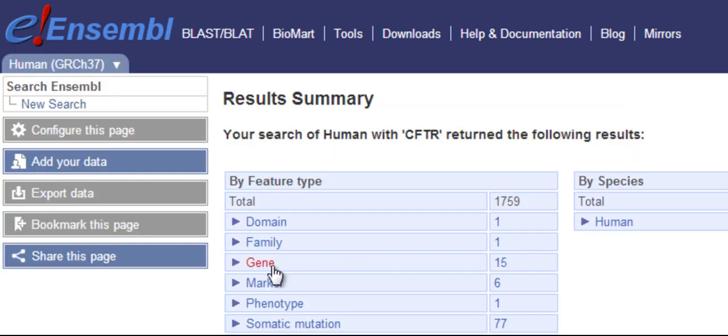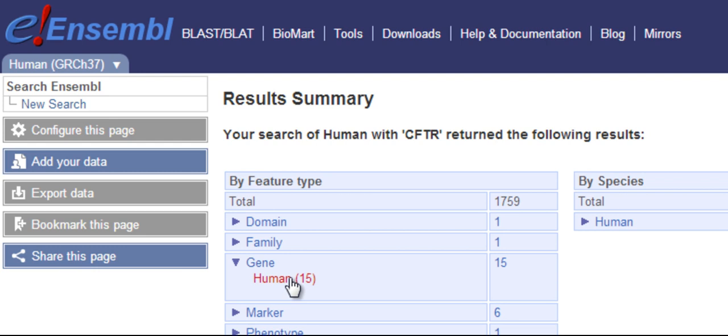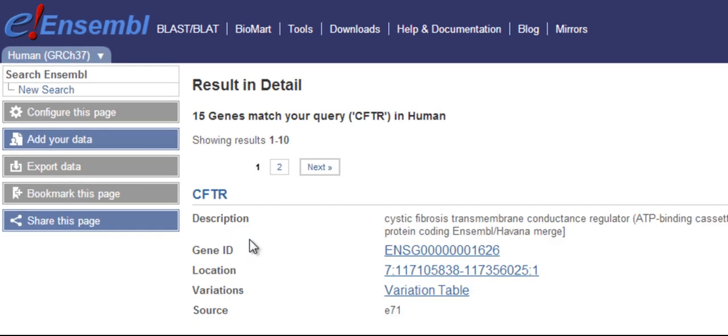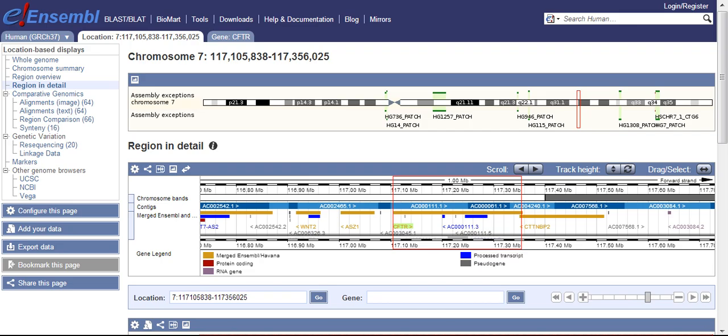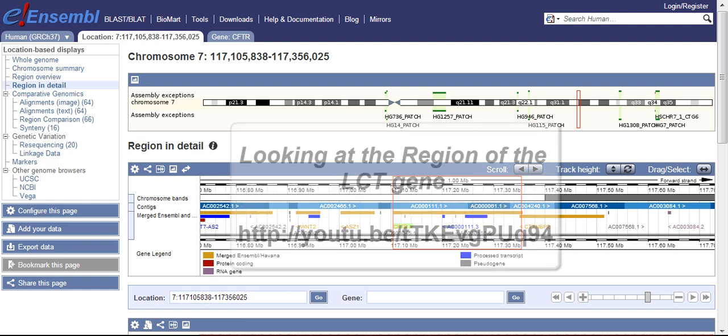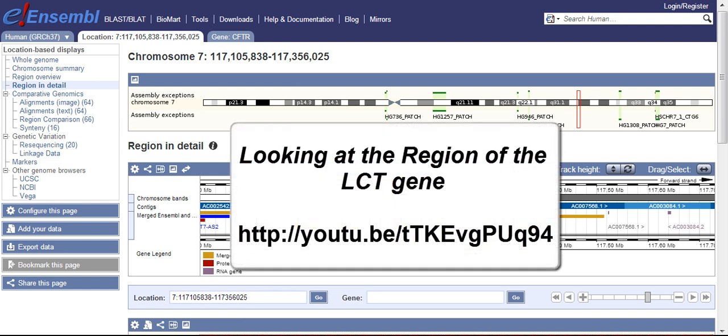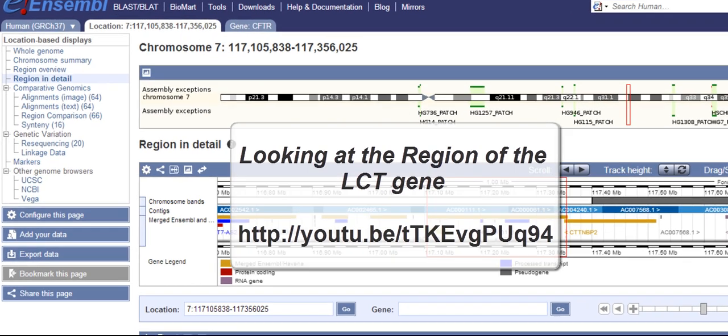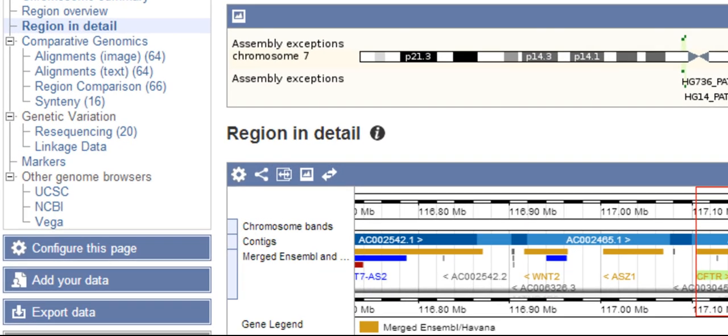Expand Gene, Human. I'm going to go straight to the location. The region in detail allows us to view data along the genome. Learn more about this page by watching this video. To add regulation data, go to Configure this page.